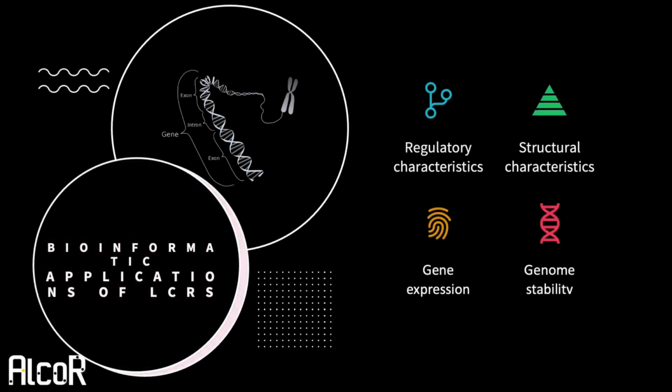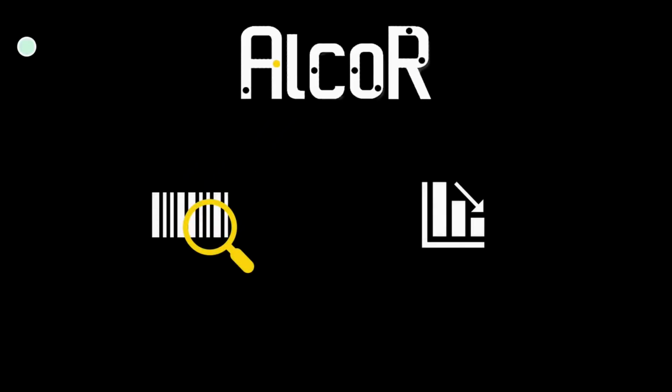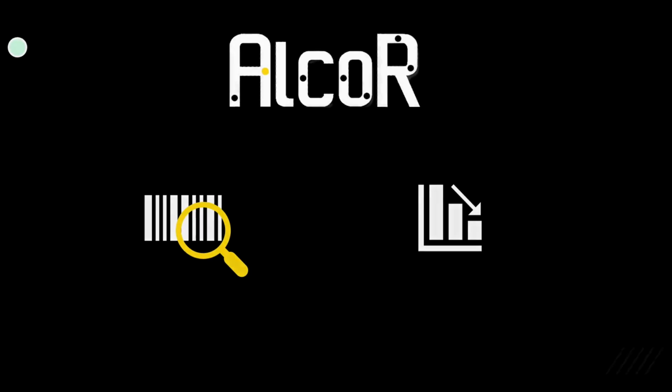In bioinformatics, it's crucial to identify these regions because of their association with regulatory and structural characteristics. This information can provide valuable insight into gene expression, genome stability, and other important biological processes. However, identifying LCRs can be challenging because of their high coverage depth, ambiguous read mapping, and other factors. This is where AlcoR comes in. It provides a solution to these challenges by automating the process of LCR identification and quantification.